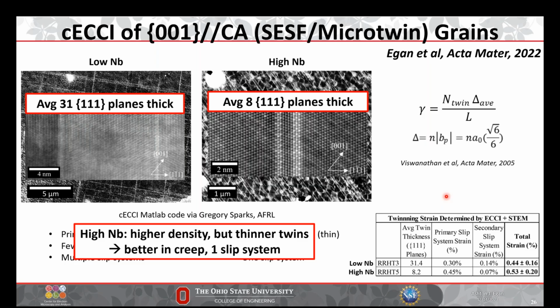And so in a nutshell, we've just used all of this EBSD kind of characterization to solve a metallurgical problem, right? Without it, we wouldn't have been able to do ECCI in a controlled fashion. So, this data was all collected from me driving around to various 001 grains, using Euler angles as an input to drive them to a diffraction condition, taking a bunch of images, sitting down for hours and measuring line densities, and then, on those same grains, using the Euler angles to determine, okay, this is how I have to lay the platinum to take FIB foils to look at these, essentially without tilting and at atomic resolution.